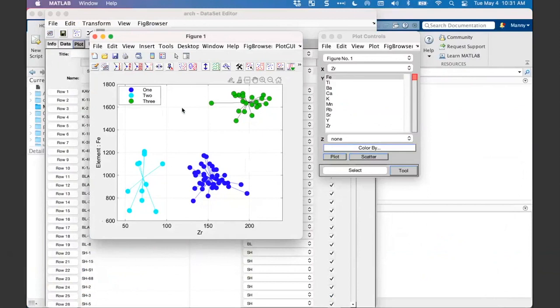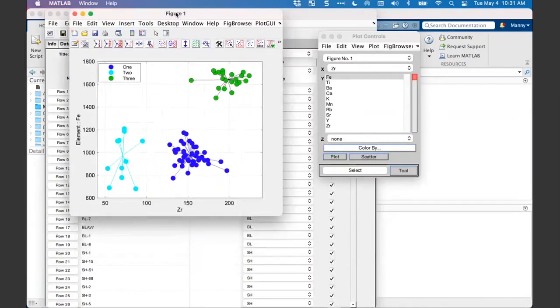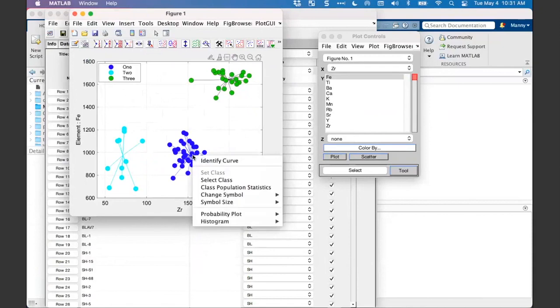All right, so the last thing, there are a couple more things I wanted to show you with this, and that is that sometimes you want to have a more descriptive interpretation of what the clustering is doing. A way to do that, and I love this tool, I have used it a lot, is that if you right click on any of the data, you see here at the bottom, you can display the histogram for that data against the X axis data or the Y axis data.